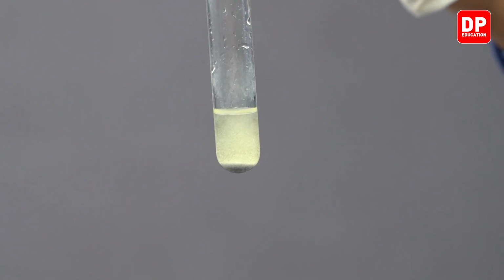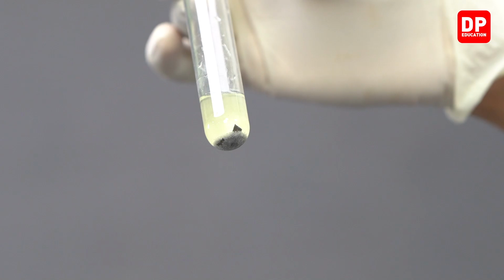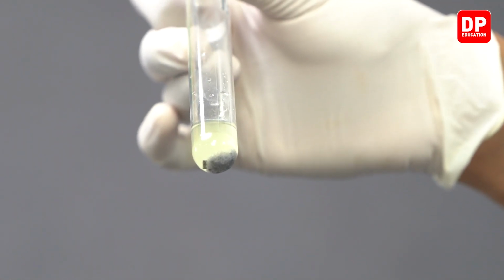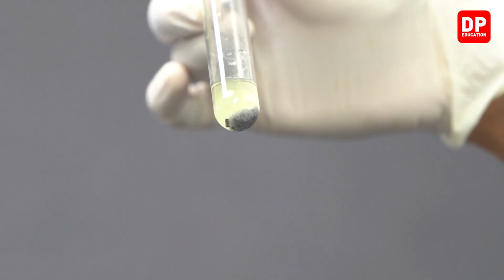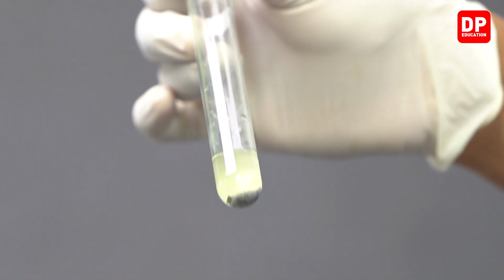The solution above has started to change color, and the grayish precipitate that you see at the bottom is due to lead 2 plus aqueous ions turning into lead solid. So students, this is a very clear displacement reaction that has happened.